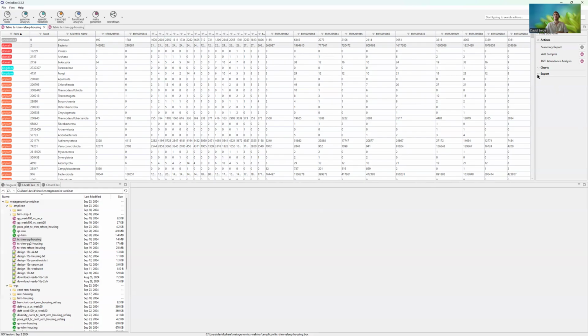If you want the original counts from Kraken, you can export them here in the side panel on the right. You can export the data as it is, or in Kraken format. So you will see that there are some reads which are aligned to bacteria because Kraken didn't know anything more specific about it. This can also happen at other ranks. But yeah, maybe it's not that important.